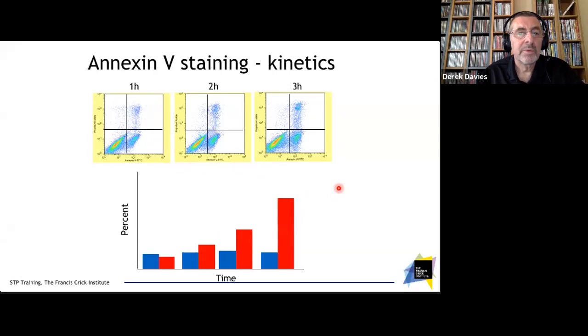So one question that we get asked with annexin is, these cells are obviously dead. They're brightly positive for propidium iodide. But what about these things here? Death isn't an all or nothing procedure. Well, it is. But remember, what we're looking at here is permeability. And cells don't suddenly become impermeable and then immediately permeable. There will be a gradation.